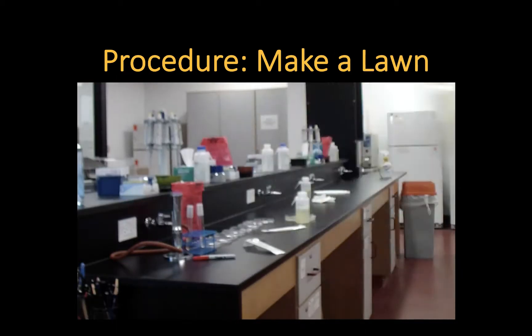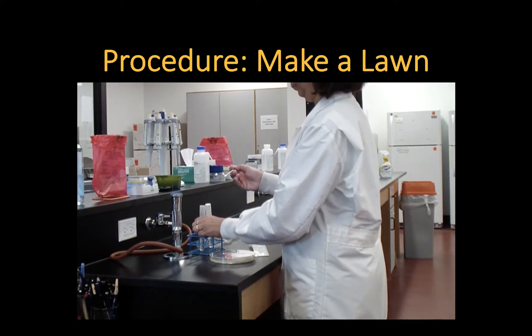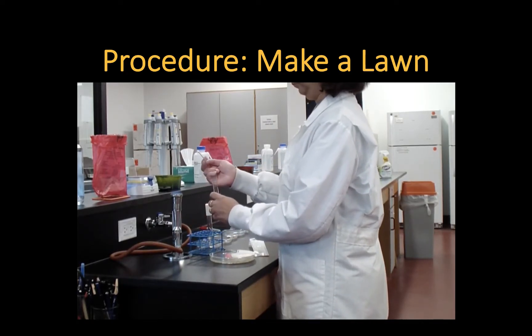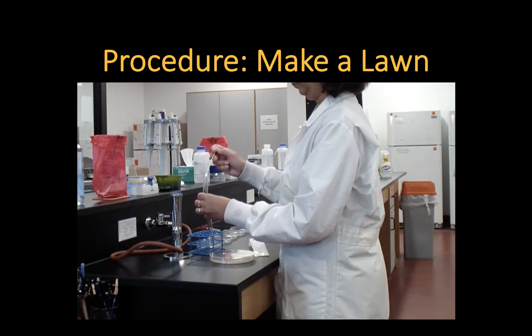Now you're going to make a bacterial lawn. To do this, you use sterile technique. Remove the cap of the tube, keep it in your hand, and flame the top of the tube.